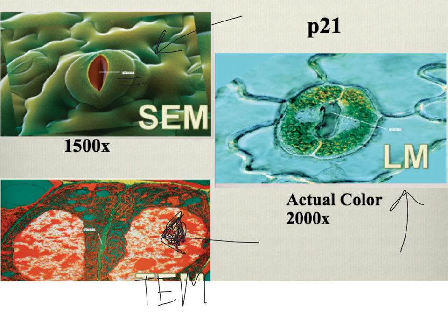And then this is a light microscope. LM is going to be light microscope. And this one is zoomed in 2,000 times.